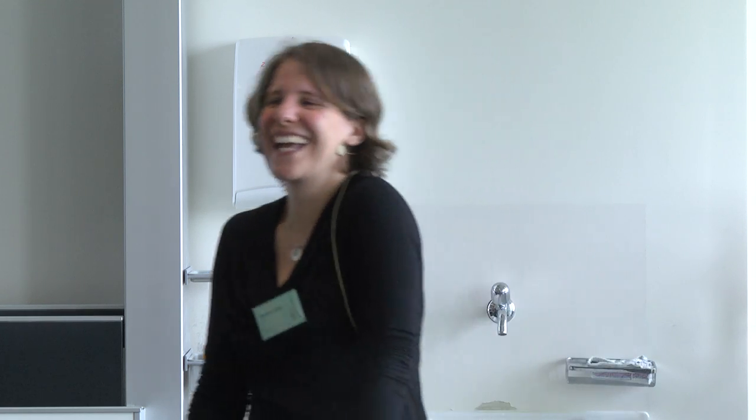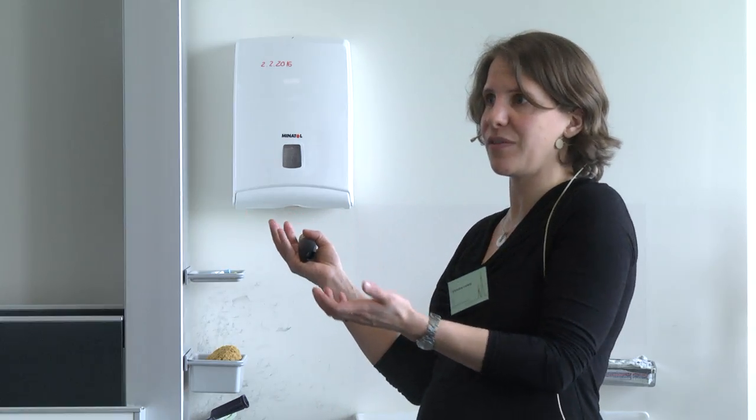May I ask a couple more questions? Sure. One would be, I only worked on Orbitrap instruments, and I was always told that quadrupoles are much better on triple quad instruments. The quadrupole itself, yes, to isolate precursors. Oh, this is something I wouldn't say. I don't think so. It's just that the quadrupole is what is very good in terms of sensitivity.